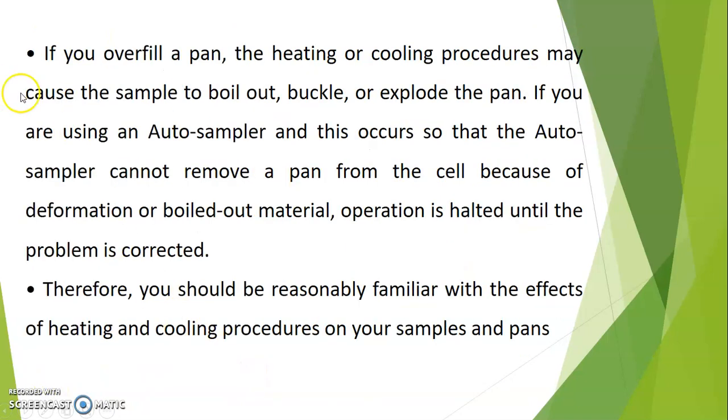If you overfill a pan, then the heating or cooling procedures may cause the sample to boil out, buckle, or explode the pan. If you are using an autosampler and this occurs, so that the autosampler cannot remove a pan from the cell because of deformation or boiled out material, operation is halted until the problem is corrected. So it is necessary, when we place the sample into the sample holder, that the sample quantity be small, and it should be placed in a proper manner into the sample pan.